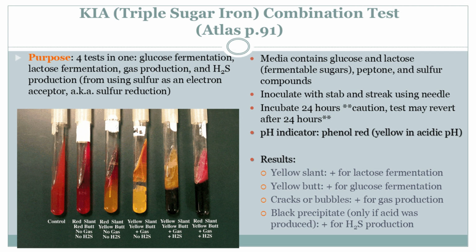Well, that means we have to do some more detective work. It could be that we just made a mistake in the lab. That always happens. Or it could be that we've stumbled upon something completely new. Like, what if it's a new species? It could be a new species or a new strain of bacteria that we've never seen before. Or it could be that this bacteria is doing something really weird that we just haven't observed before. So like breaking the rules of biology as we know it.